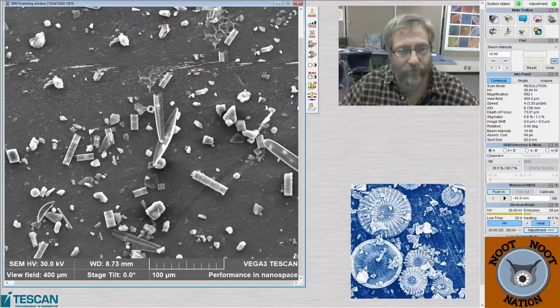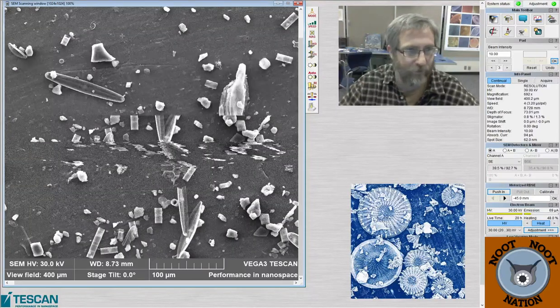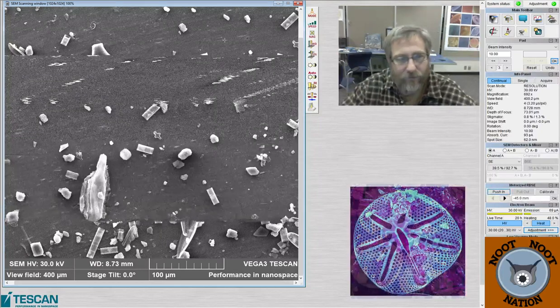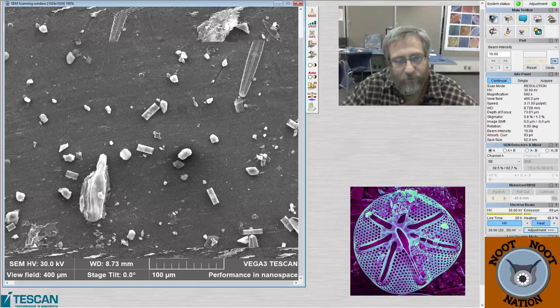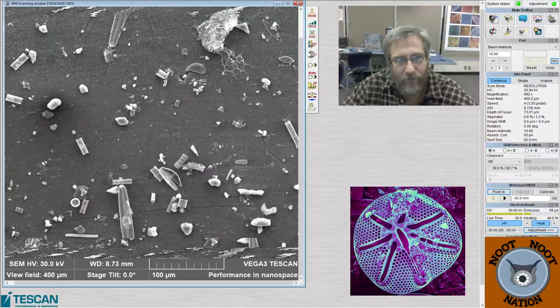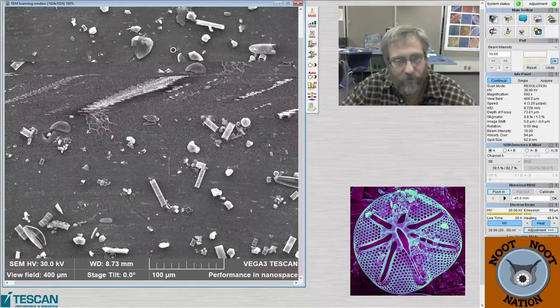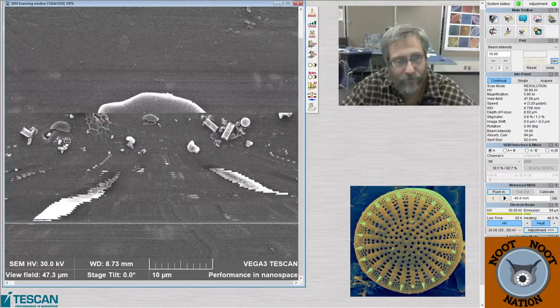I recognize them, but I don't know their names, because a lot of chrysophytes, they just gave them numbers, and all the books I have just have numbers. So I'm not going to memorize that's number 36. And that's because they usually don't know the organism that's associated with the chrysophyte cyst. So they know that an organism created it that's different than the actual cyst.